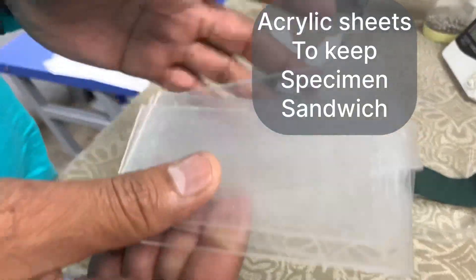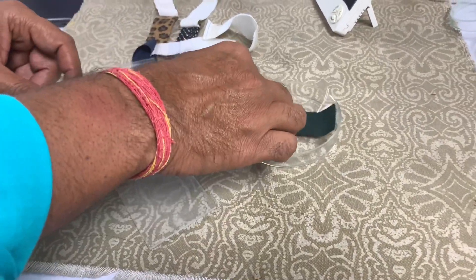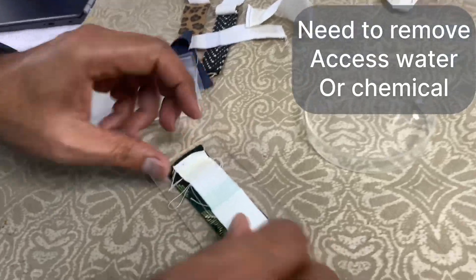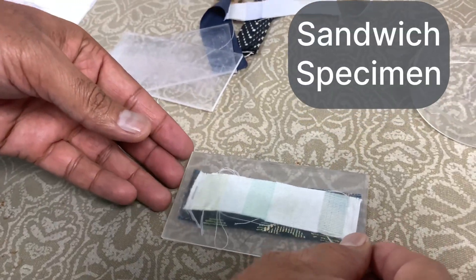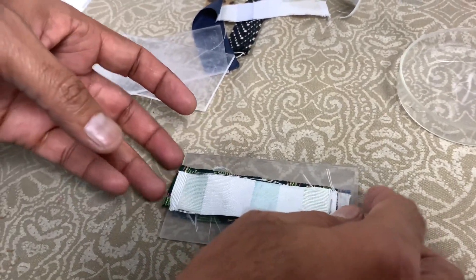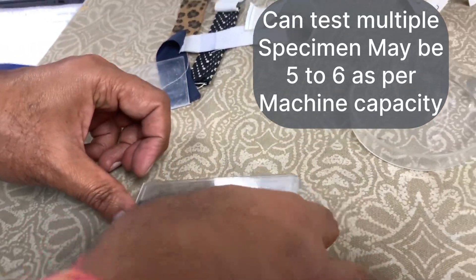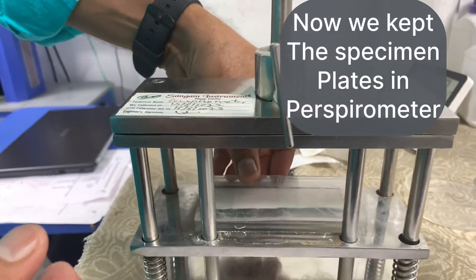These are the acrylic sheets in which we need to sandwich the specimen. This perspirometer can test at least five to six specimens at one time because it has the space. This is the perspirometer, and we need to insert the specimens into it.